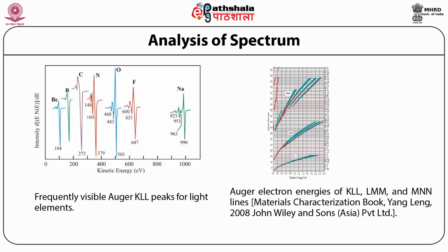The Auger energy in the differential mode is represented by a sharp peak or dip position corresponding to an Auger signal.